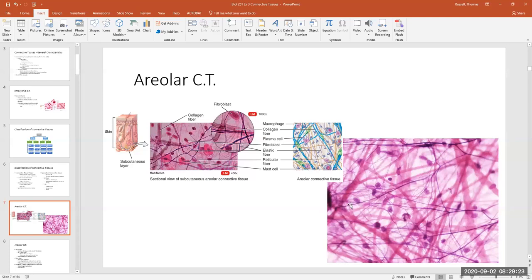Wherever you see a little round structure, that's the nucleus of a cell in the tissue. The ones with elongated nuclei are called fibroblasts. Areolar connective tissue has an abundance of different cell types — neutrophils, eosinophils, macrophages, and other white blood cells — all scattered through it.